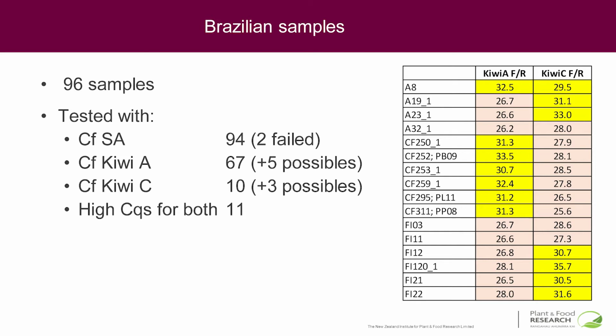So we can't say that they weren't detected by the Latin American clade primers, but it's just a reminder that experiments do fail a bit. In this case, there were bubbles in the mix. That's why they failed. Otherwise, we'd say it's detecting all those Brazilian isolates with our Latin American clade primers.